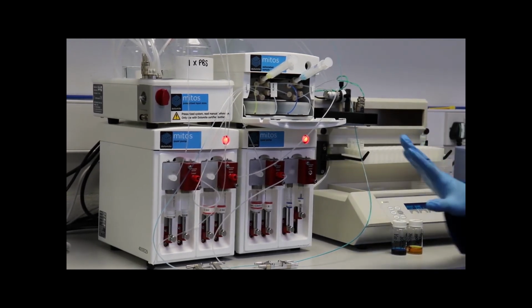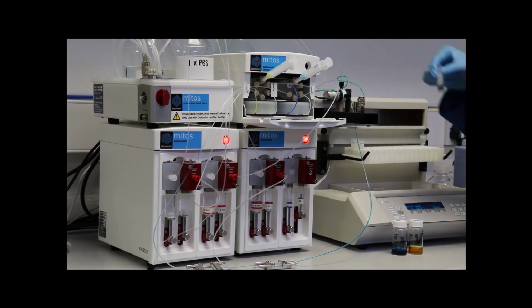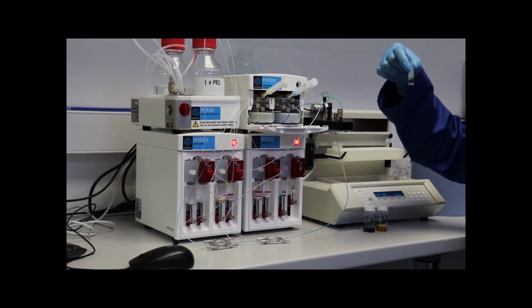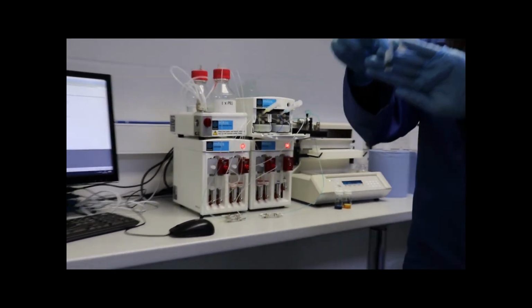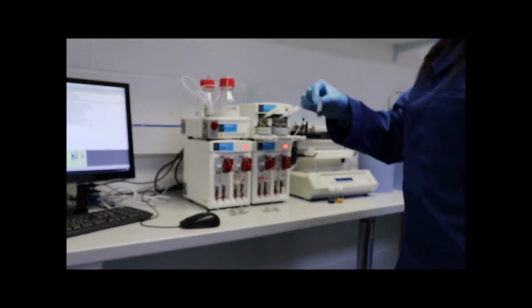Now the system is undergoing a washing cycle to remove any contamination of the fluidic line in preparation for the second. Maybe you can see this in the camera, maybe you can't, but we've got 500 microliters collected in this vial. So that's the first experiment done.